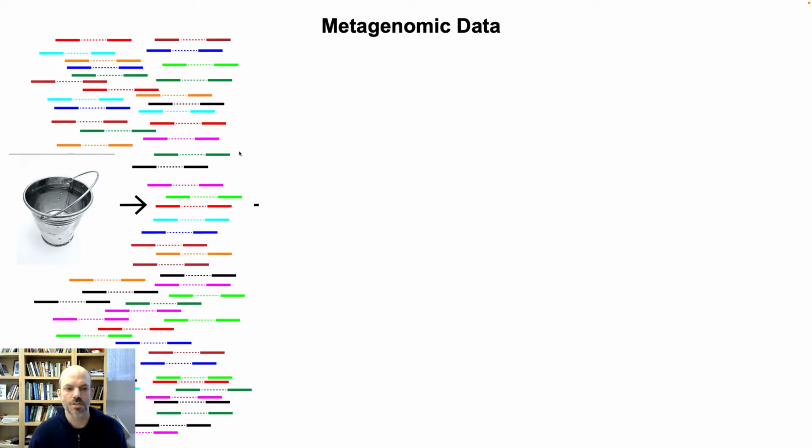And so if we chose to fragment our DNA into pieces of, let's say, 500 bases, and we sequence 150 bases on one end and 150 bases on the other end, we now have covered a total of 300 bases out of the 500 bases on our chunk of DNA. So we've got a gap in the middle of about 200 bases. Right? So 150 and 150 makes 300. We've got a gap in the middle of 200. So now we have covered, that is how our 500 bases of genomic DNA is distributed.